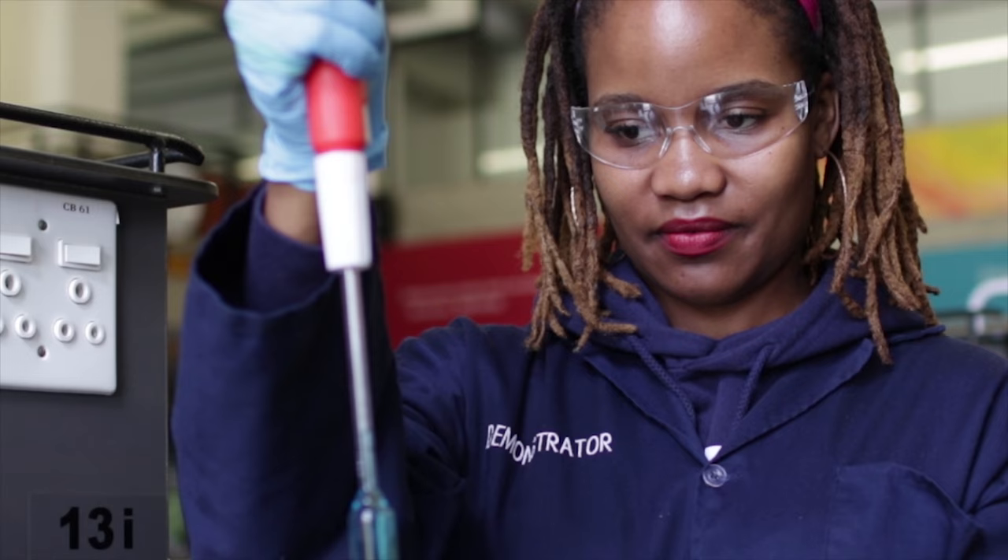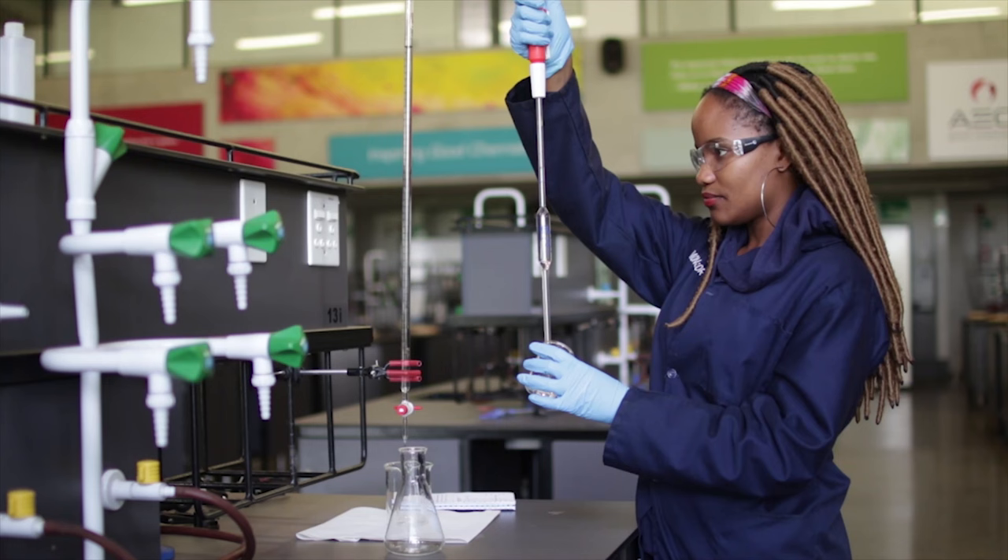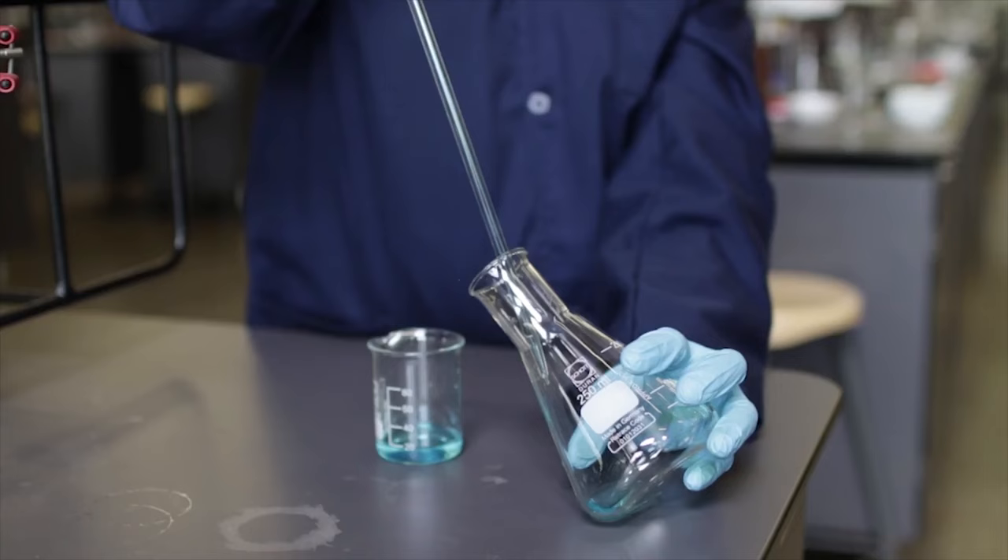However, if the meniscus falls below the graduation line, the solution must then be sucked up again to about two to three centimeters above the graduation line and the procedure on lowering the meniscus is repeated.